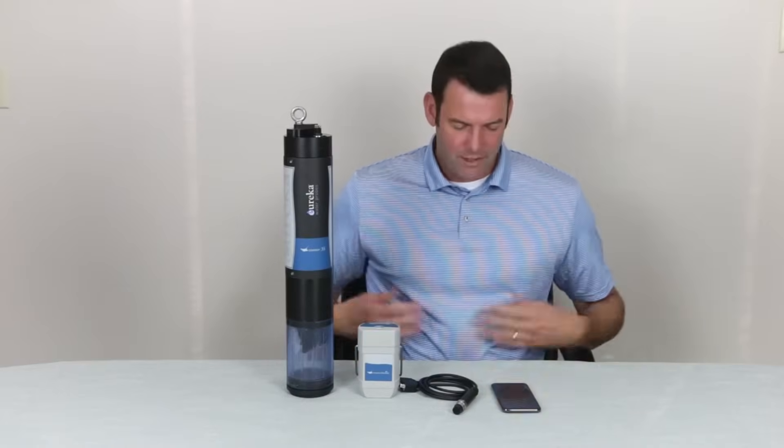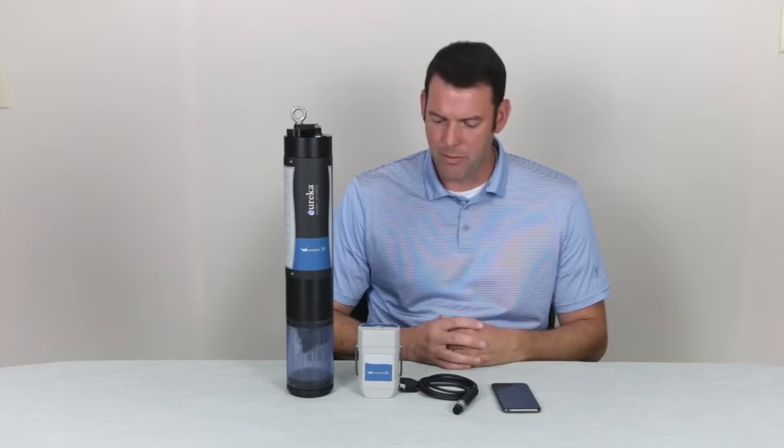Hello everyone. Thank you for coming back to another Eureka Waterprobes instructional video. Today we're going to cover the home screen of the Manta Link app, which you use to control your Manta Multi-Probe.